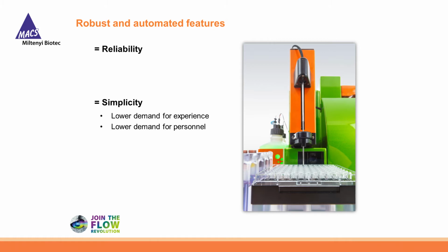So lower demand for experience and lower demand for personnel to operate devices, but also to be in front of them while they are acquiring data.